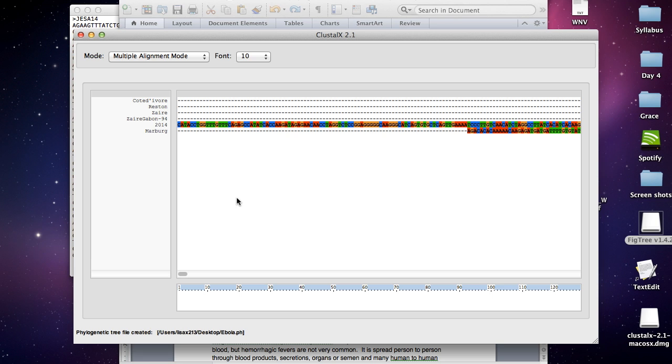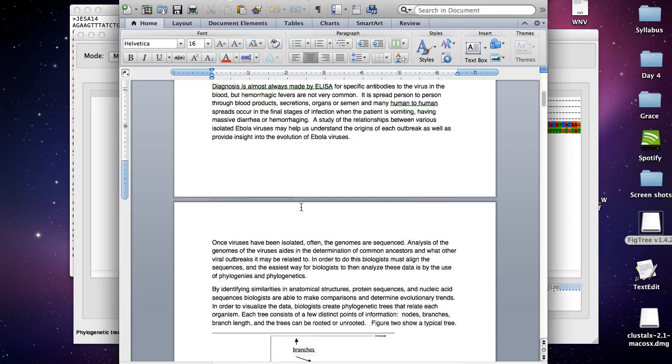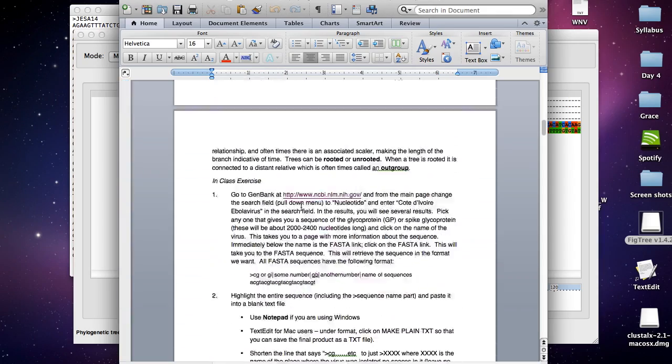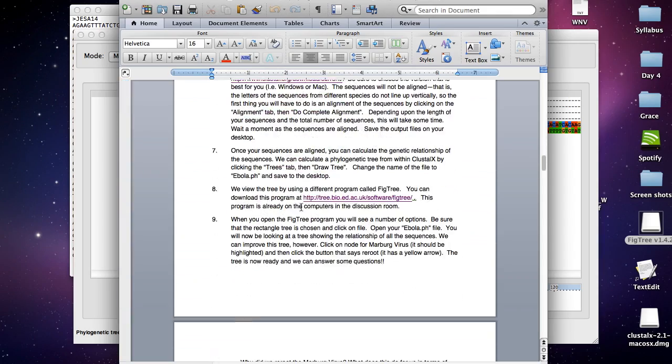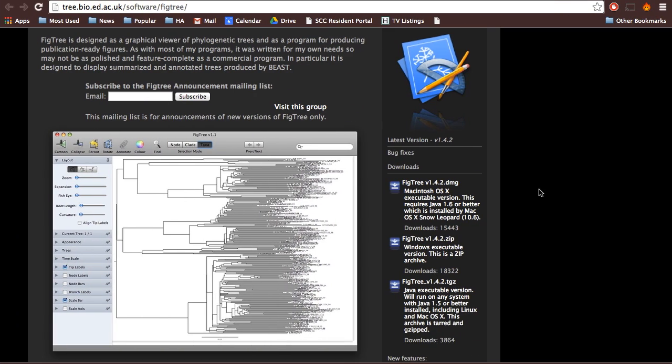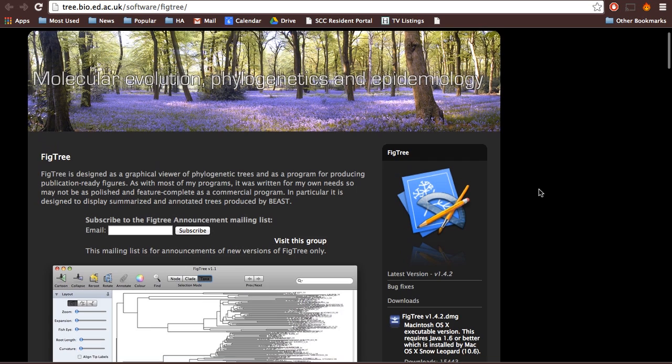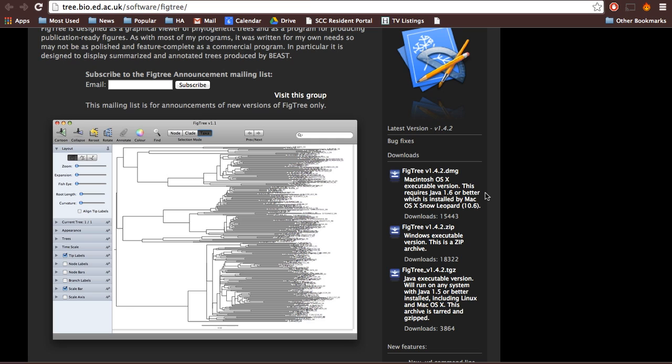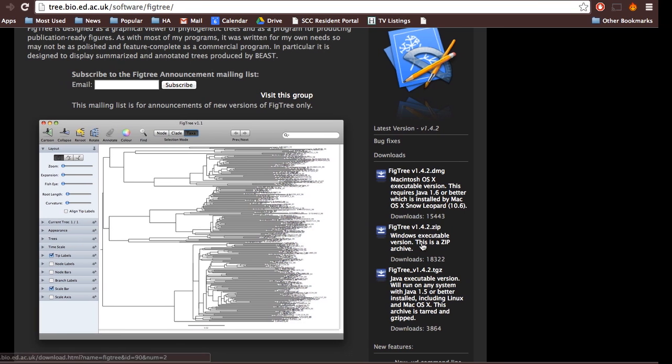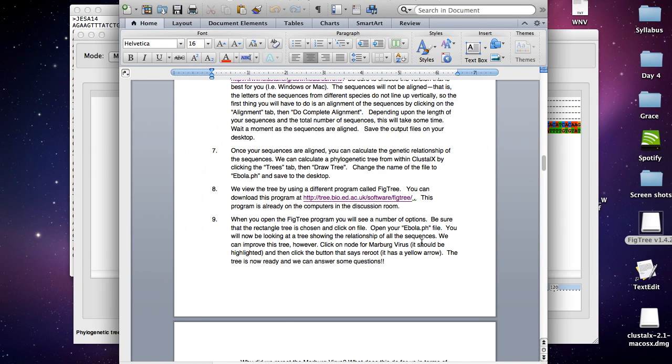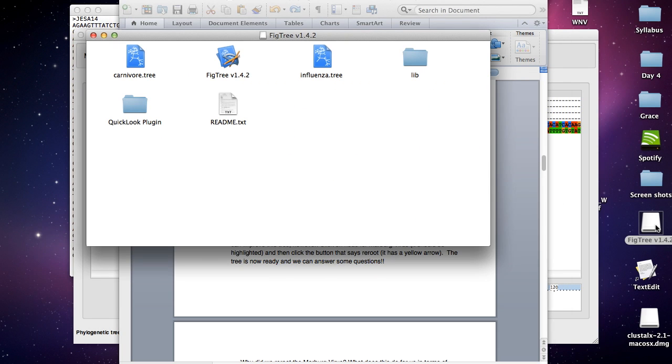Now we want to actually view the tree that we drew using a program called FigTree. You're going to need to download the FigTree program by going to this website right down here. Once you click on that, it'll bring you to this page. The downloads are over here, and it's based off of what operating system you're using. Since I'm using a Mac, I would download this one. Using Windows, download this one. I already downloaded it.